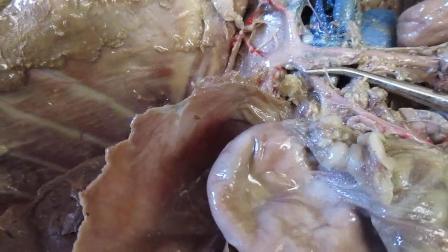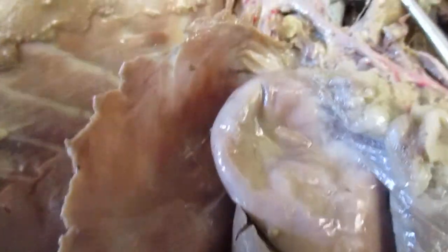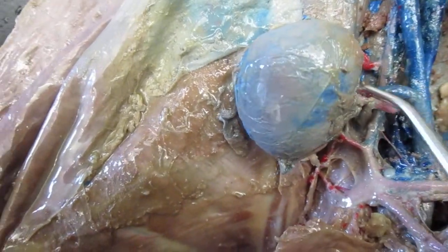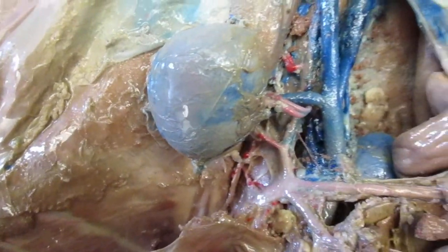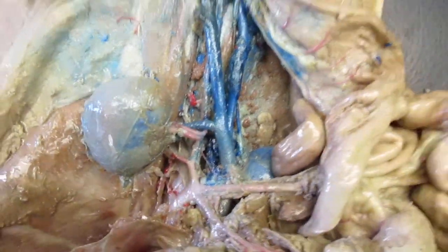So right here we see the celiac trunk, gastrosplenic artery right there, and then your superior mesenteric artery, and then renal artery, and then renal vein, kidney. This right here, it would be the inferior vena cava. Okay, and latex sort of busted there. We'll switch.